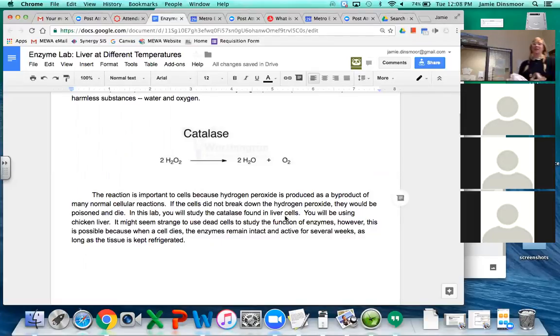Okay, so we have something that everyone probably knows what it is. Hate that stuff. Hydrogen peroxide, right? You probably poured this on your cuts, or let me rephrase that. Your parents probably held you down and poured it on your cuts while you cried and screamed, right? So we all know what it is. It's a bubbly thing, right?